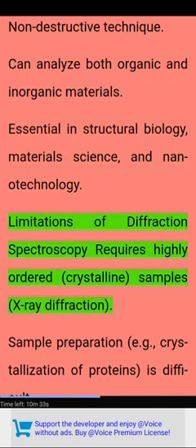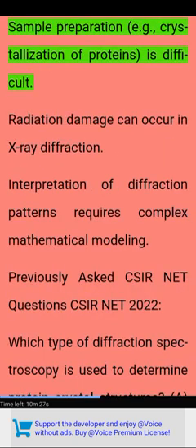Limitations of diffraction spectroscopy: requires highly ordered crystalline samples for X-ray diffraction. Sample preparation, e.g., crystallization of proteins, is difficult. Radiation damage can occur in X-ray diffraction. Interpretation of diffraction patterns requires complex mathematical modeling.